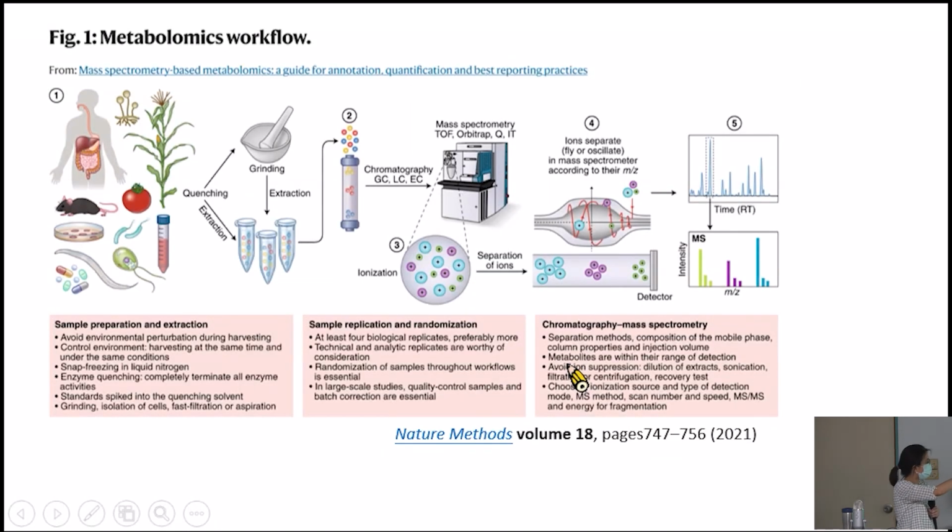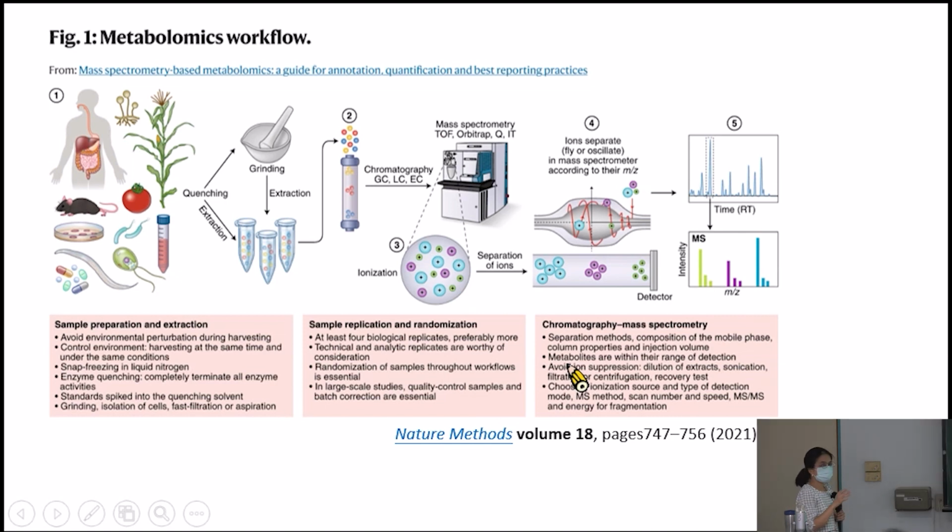This paper comes from Nature Methods in 2021. This is basically the workflow of metabolite determination. Okay, you can find that there are multiple steps, including sample preparation and sample separation. So we will look into the details.